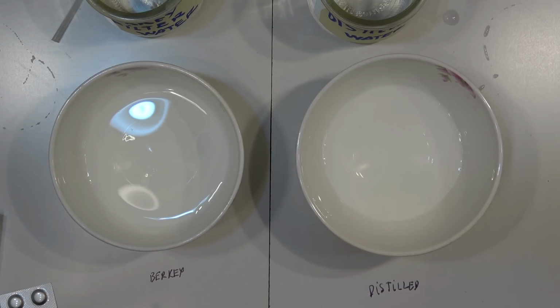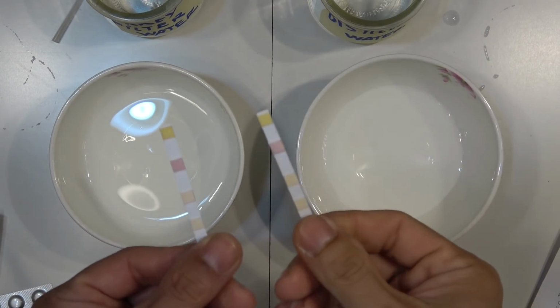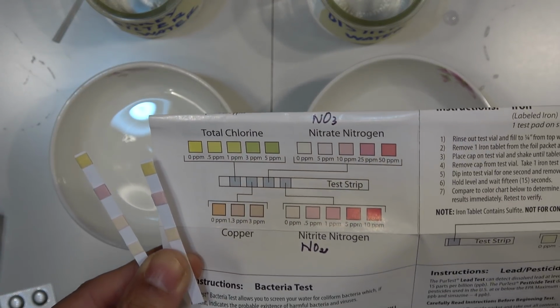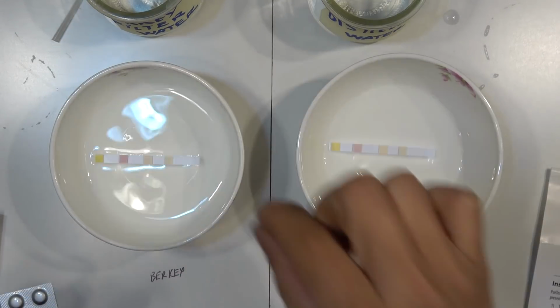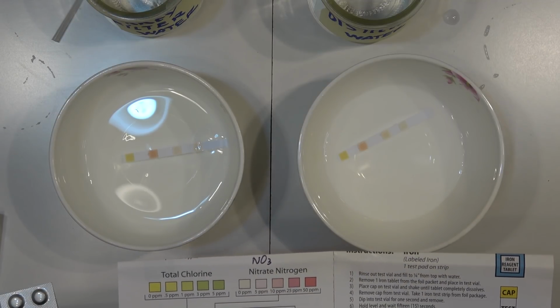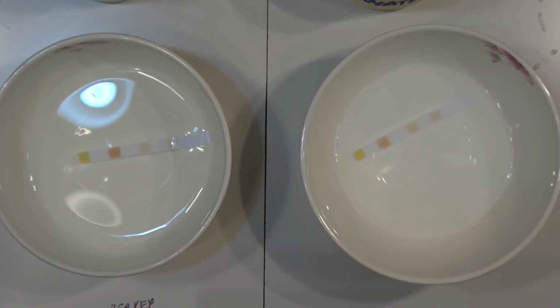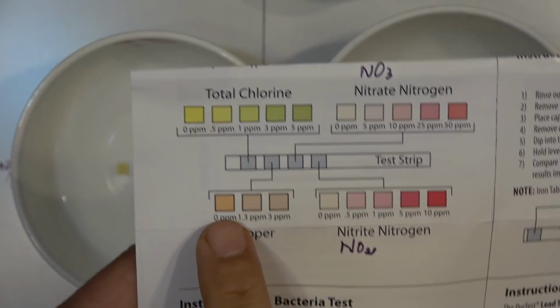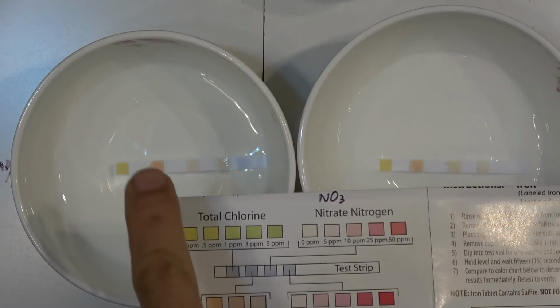Here we go. I'm ready for the 4-way test. The instruction here says that immediately after you drop the strip in, you have to read the chlorine test right away. And then you have to wait 45 seconds for the other 3 tests. Looks like the chlorine is the same for both, and it looks yellow, so there's no chlorine left in both samples. Let me zoom in so we can see here. The second one is the copper, and it looks like there's nothing left, so 0 parts per million on the copper. There's no copper here.